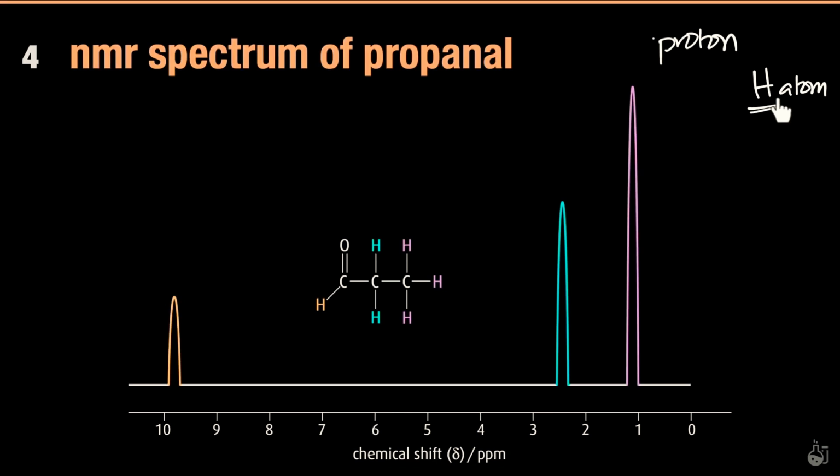And what do I mean by hydrogen's chemical environment? The atoms it is bonded to around itself. Now, the 3 peaks are telling me that the hydrogens have 3 different environments. Even though the molecule has 6 different hydrogens, there are only 3 different environments. You can tell, at least by the color coding here, that these 3 labeled purple are referring to this peak right here.